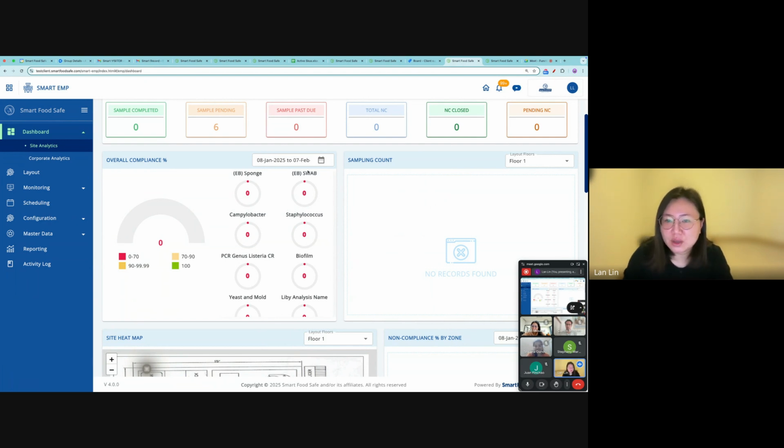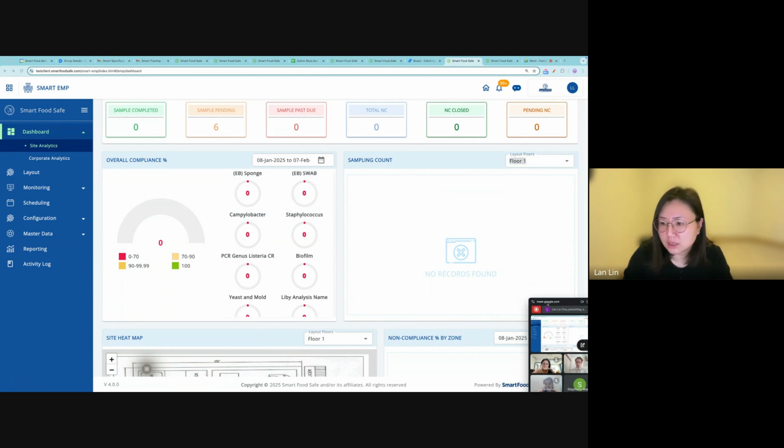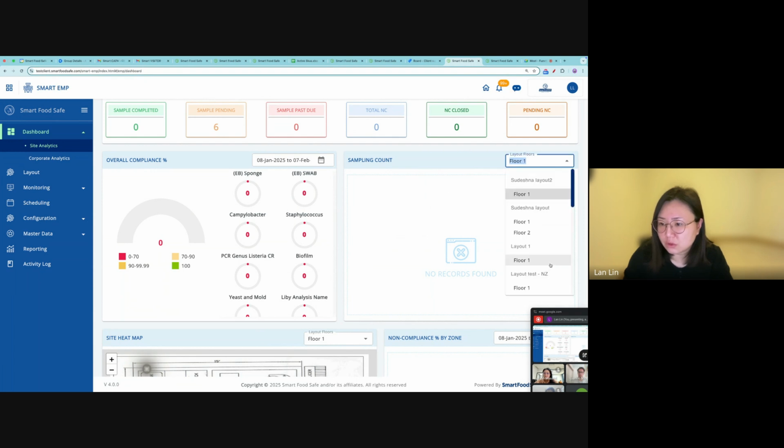Okay, then you have the sampling count. You just select the corresponding floor. It's going to tell you how many non-compliance and compliant results you have.